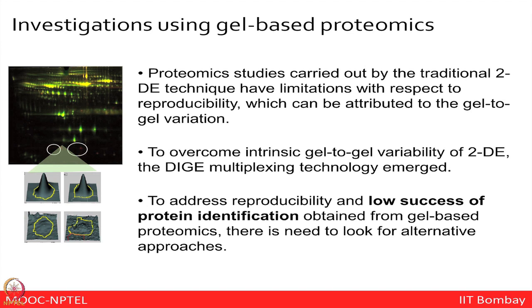If you want to summarize overall what we learned from gel based proteomics, gel based proteomics are very handy, very simple, easy to do technology, but because of reproducibility issues and limitations of gel to gel variability, the focus shifted more towards quantitative proteomics based on DIGE. DIGE is a multiplexing technology which offers a much more sensitive and much more reproducible way of doing gel based proteomics.